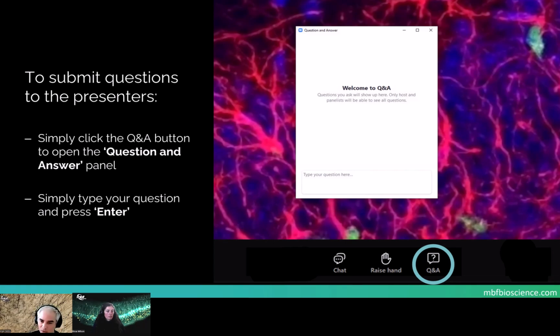There's one question about how we compare to other platforms like Aphoria. I don't know much about these. I recently heard about this platform. As far as I know, the main difference that I'm seeing is the way that we train. We are doing the training in house, whereas in these cases the end user is classifying the object. So that would be one difference, I believe. But I cannot say much about how we differentiate or compare exactly to Aphoria.